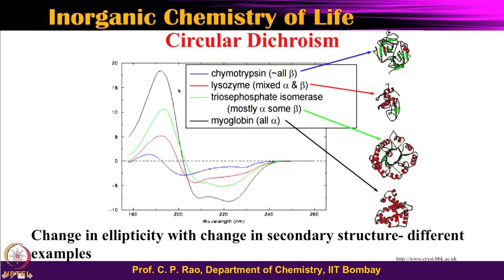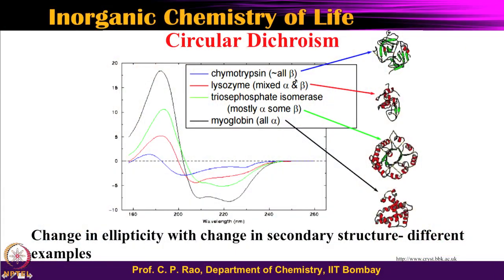So, CD spectroscopy is a very strong method which will help us to explain the protein secondary structures. Now, when you add some ligand to this particular protein, what happens? What kind of things happen in beta sheets, alpha structures, all this can be identified by circular dichroism. How will you do that? You take your enzyme or protein, then you add some small molecule or a metal complex or something, and then see what kind of changes are coming in alpha and beta and random coil.